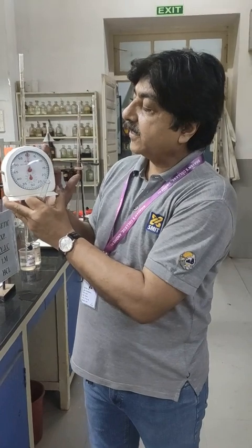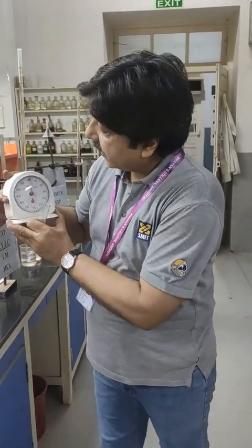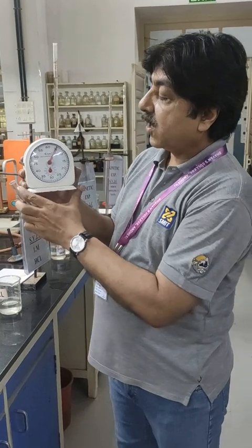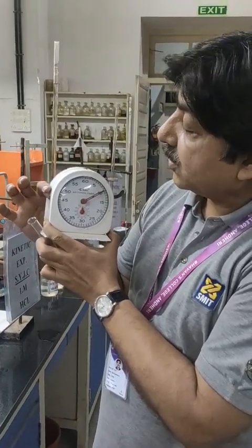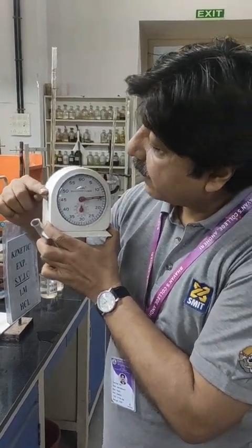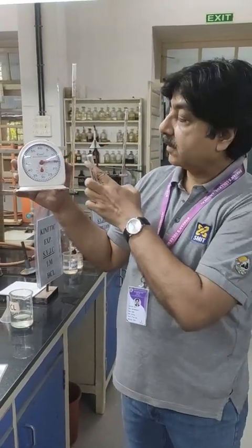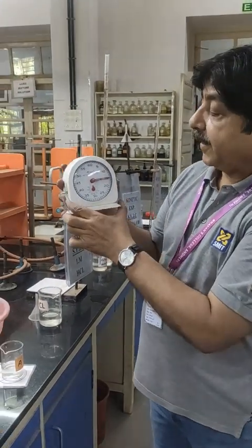Now I have reset this. Now let me start it again. I have started this again, and you can see the watch is in motion, correct? Now when my reading gets over, to stop this, the same arm has to be pressed down, and see, right.